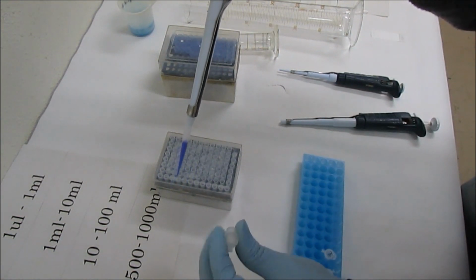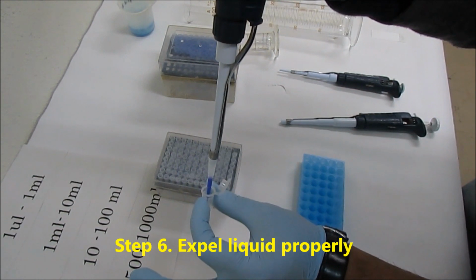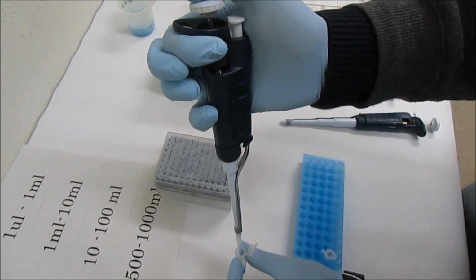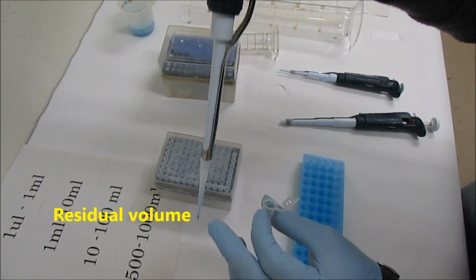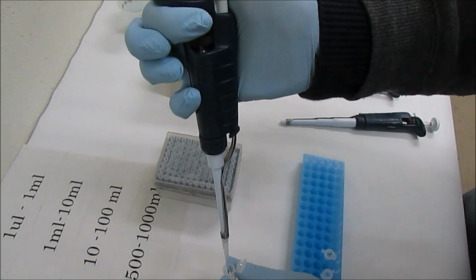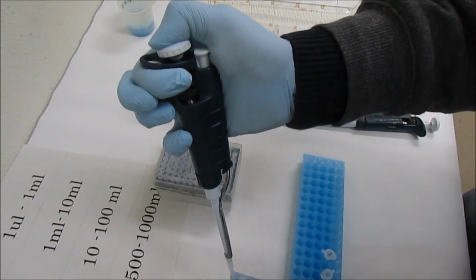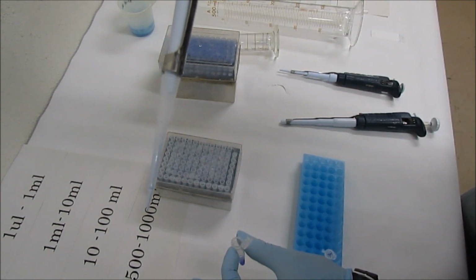Now I want to transfer this to a second tube. Here you see this is an empty tube. Now I transfer. I press again to the first stop, and you see there is also some residual liquid inside the tip. Here I use the second stop to expel the liquid completely. You see, just press forcefully, and there is no more liquid inside the tip.